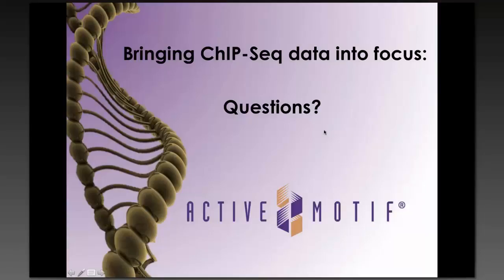The second reason was that we thought that if there were global changes occurring in your sample and you used the histone antibody, that you might effectively be changing the concentration of that antibody in each of those samples. So if there was dramatically more of the modification in one sample, you would have more antibody binding, and the other sample would have more free antibody. And that might actually affect the pull down of the Drosophila chromatin and artificially skew the normalization.